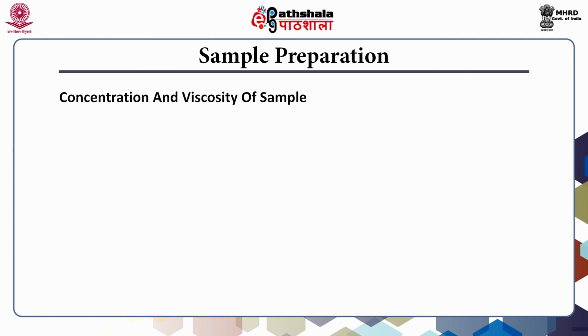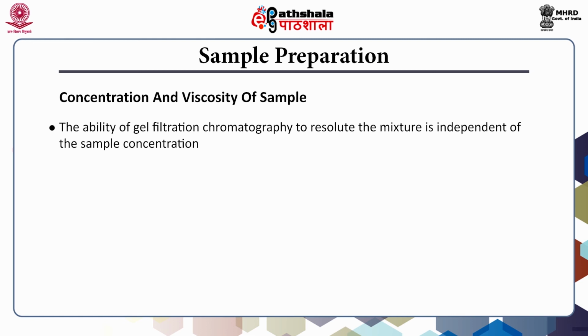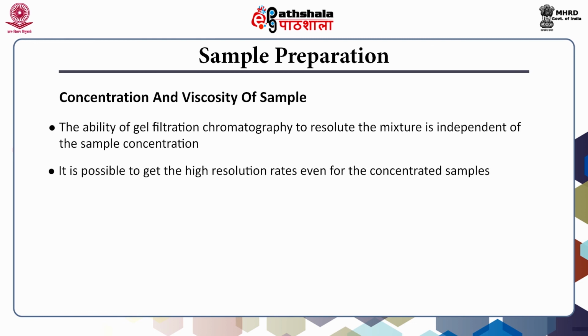Concentration and viscosity of sample. The ability of gel filtration chromatography to resolve the mixture is independent of the sample concentration. It is possible to get high resolution rates even for concentrated samples. However, gel filtration chromatography is dependent upon the viscosity.